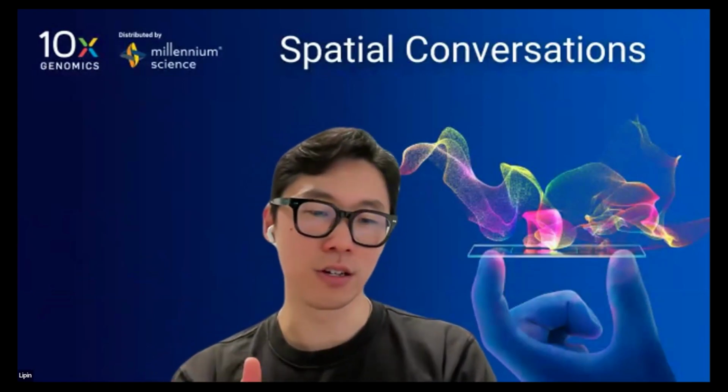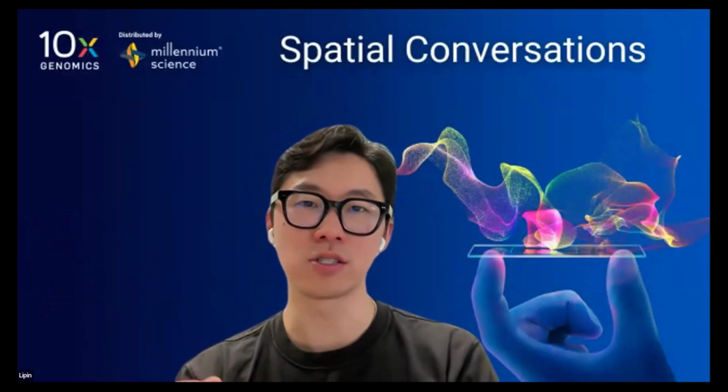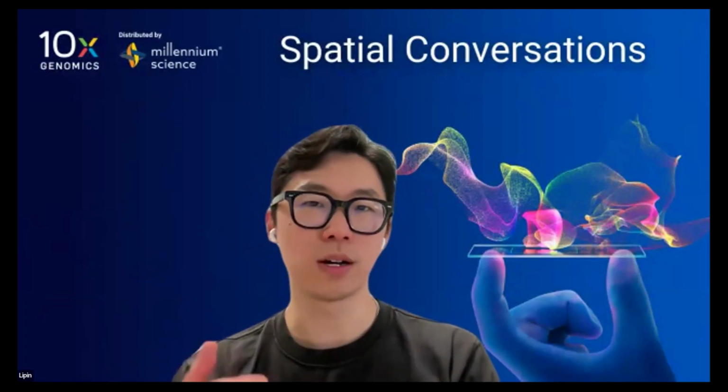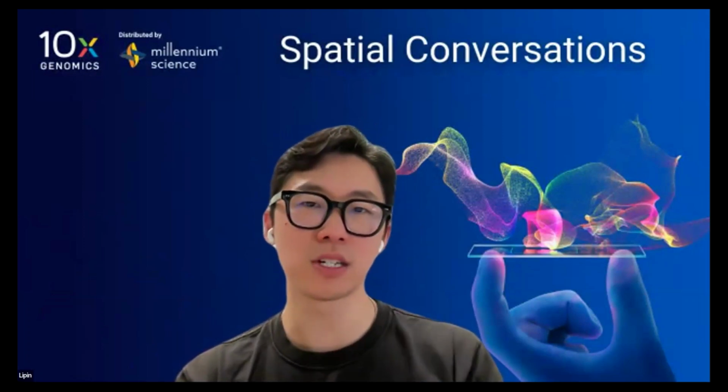But having said that, there are a few things that will pop up from time to time. If you're trying to deviate a little bit from what Seurat is meant to do, you might need to write some code and subset certain things a certain way to do the analysis. But yeah, if you have some basic experience, it's quite easy.